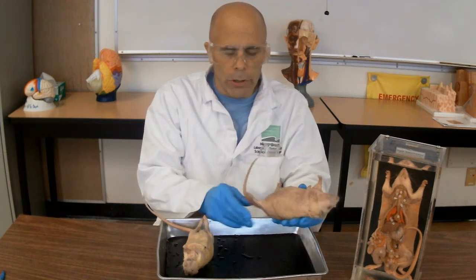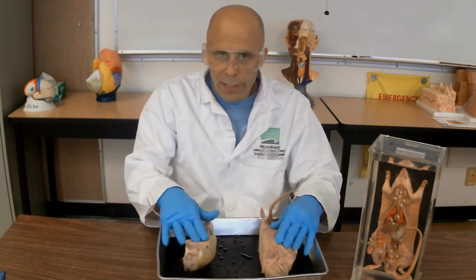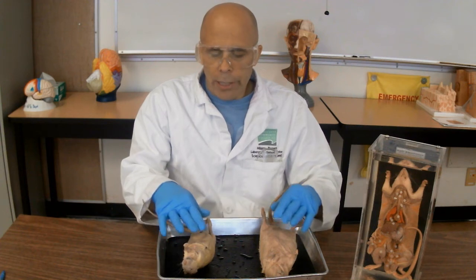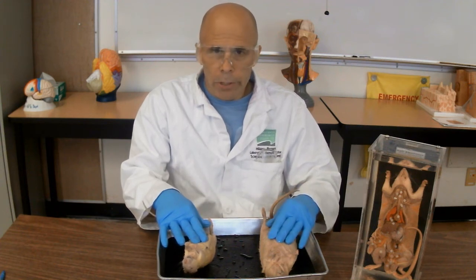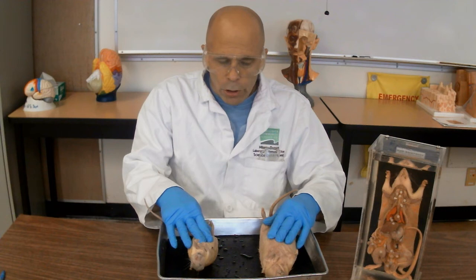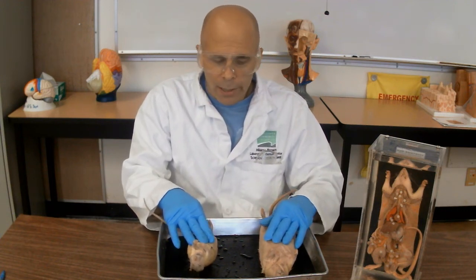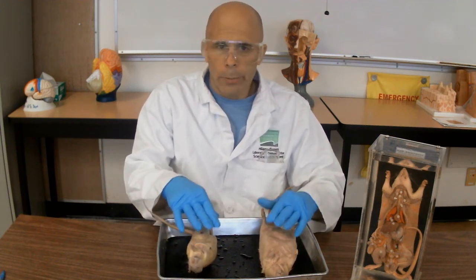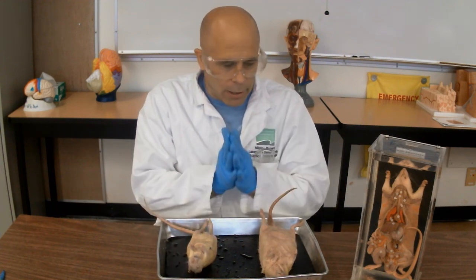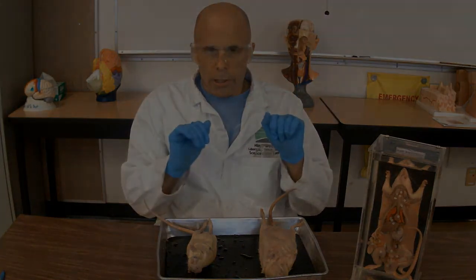Going forward, we are going to dissect both of these and compare and contrast the endocrine and reproductive structures. I'm going to go ahead and secure one of these animals at a time in the tray and begin dissecting, and you can follow along. So here we go.